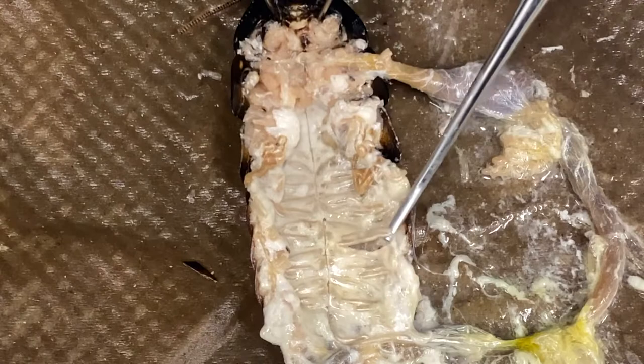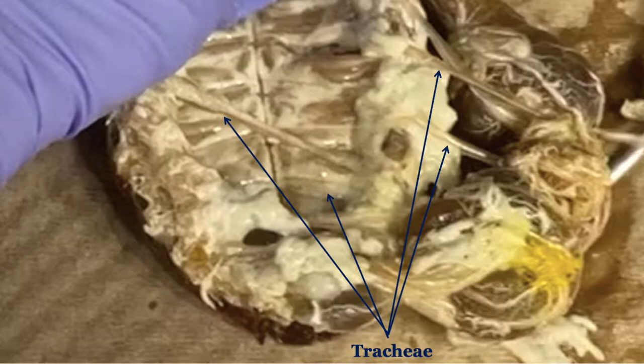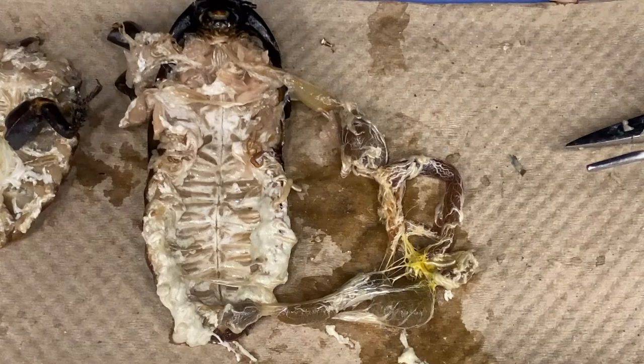Observe the trachea. They look like shiny white branching tubes. They connect the exoskeleton to the organs, providing some structure, and also carrying air from the external valves, called spiracles, to the organs.